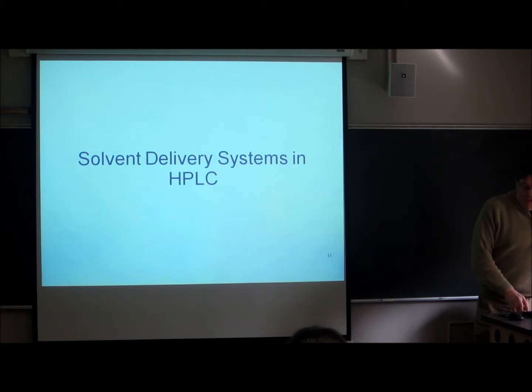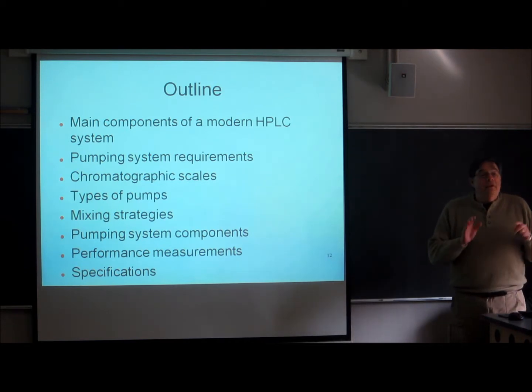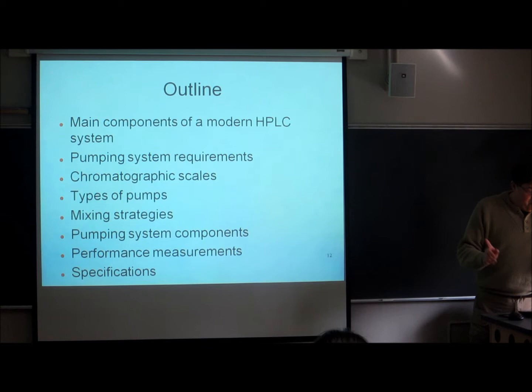Now a little bit about solvent delivery systems. We have about 20 minutes. I'm going to talk about main components. Again, these pretty pictures are all going to be on the web, so just sort of watch and you'll see a lot of things that are familiar and some things that aren't too familiar. But these are the points that I'll try to get most of.